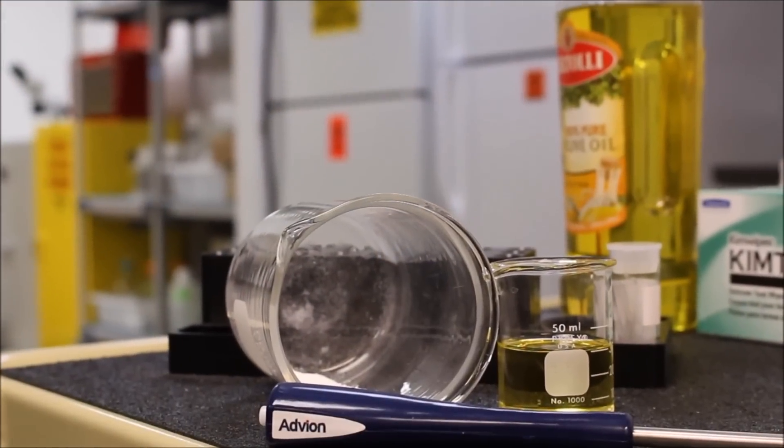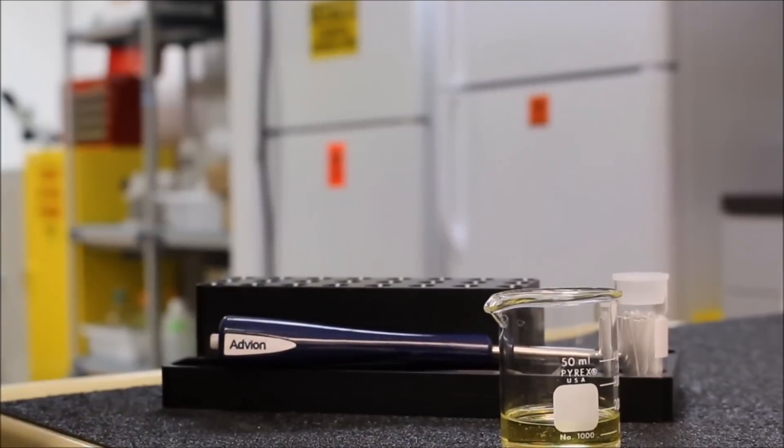It opens up a world of analysis for liquid and solid samples, reaction mixtures, food samples, natural products, you name it.